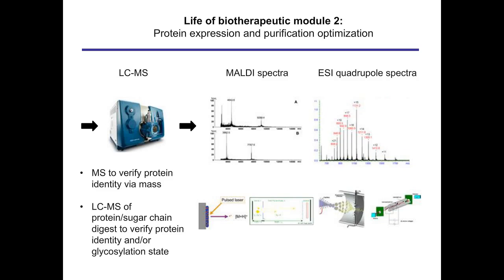This is all automatic, but the machine times the amount of time that it takes to accelerate your peptide until it hits a wall, a photomultiplier tube. And through this process, one then calculates a size to charge ratio, which I depict in the spectra on the top.